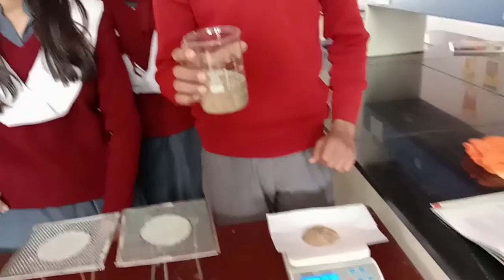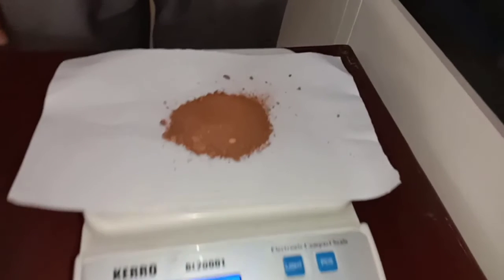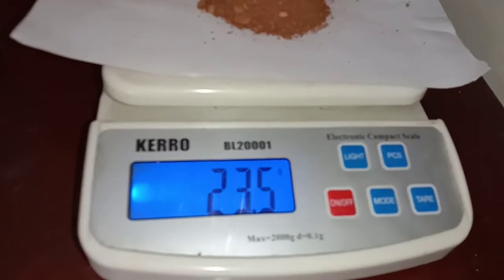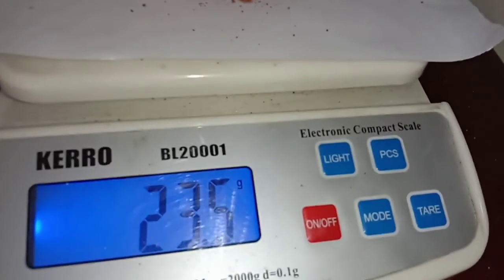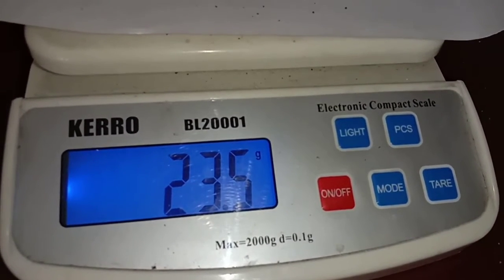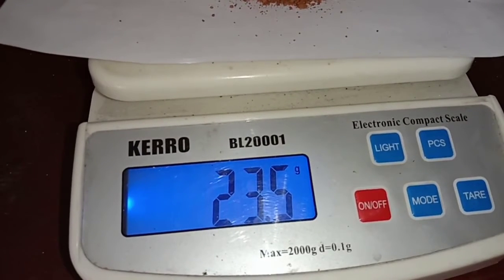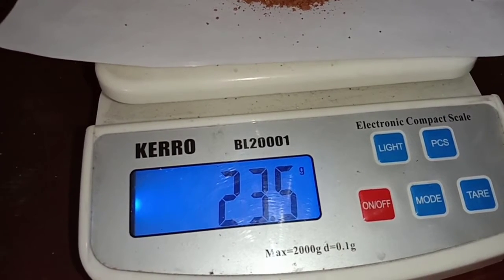So the initial reading is the initial weight of the soil in gram, that was 25 grams for both the soil samples. And the final weight of the soil in gram, or the final reading, for the sandy soil was 24.5 grams, and for the clay soil it was 23.5 grams. So what we have to do to calculate the moisture content? We have to subtract the final reading from the initial reading, divide by the weight of the soil, into 100, and we'll get the result here.